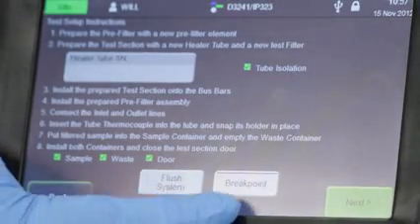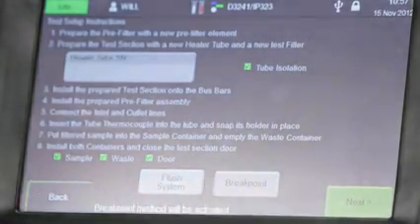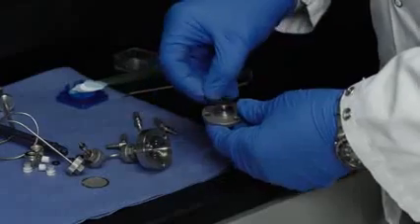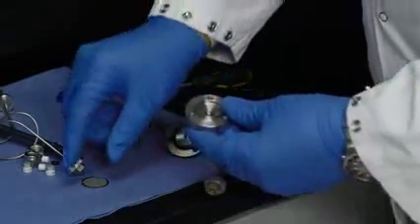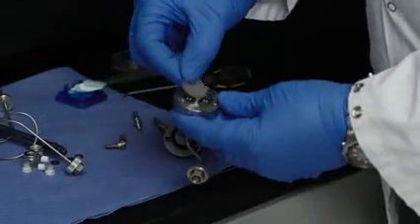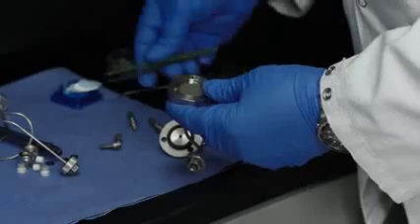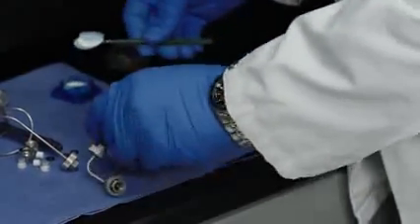Assemble the pre-filter. To do this, place the o-ring on the bottom cover, then place a white filter over the screen and the housing. After quickly checking both sides of the filter to verify no blue separator is attached, close the assembly.